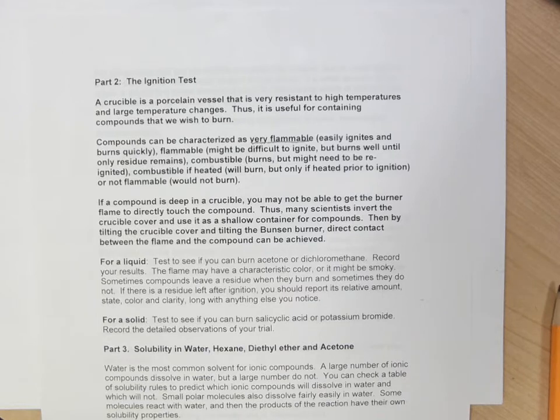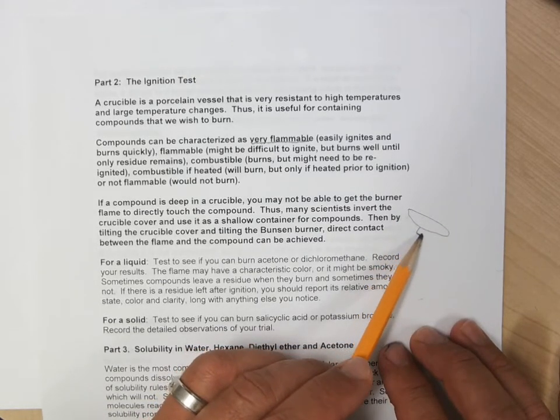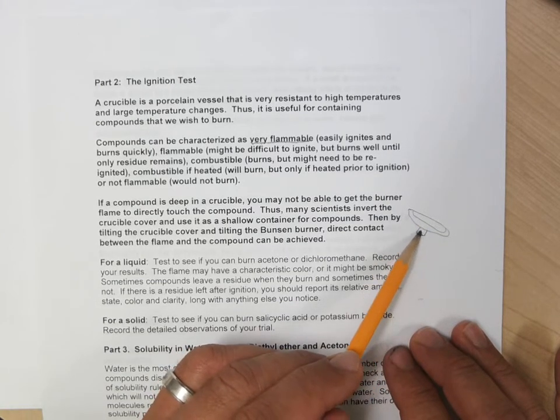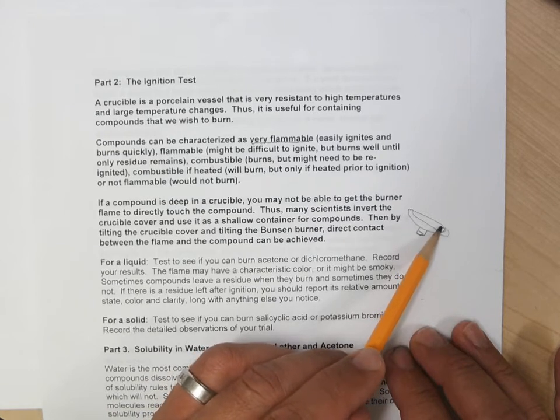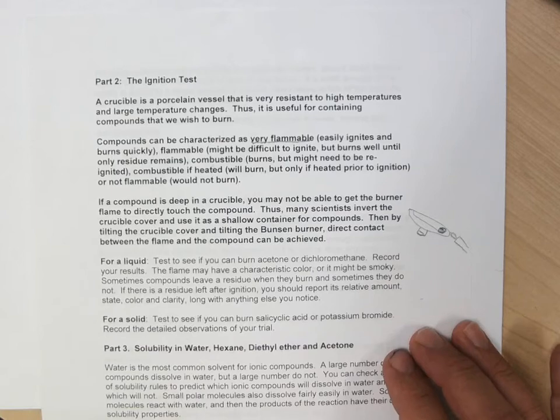Now sometimes when you do the experiment, if you have your flame too hot and you put it on there for a prolonged period of time, saying, hey, maybe this is combustible if heated, you can vaporize something that's not flammable. So you don't want to try to heat excessively. What we normally would do for this is take a crucible top. So a crucible top is like this, upside down. There's a little handle, and we put a little bit of compound in the corner of the crucible top, and then bring in a Bunsen burner at an angle and touch the flame to the crucible top.